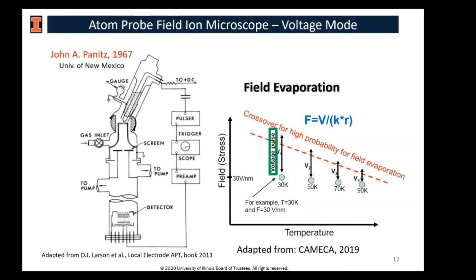As you see on the right-hand side, we have a plot of the field applied to the emitter, which also represents mechanical stress applied to the tip of the emitter, versus the temperature.